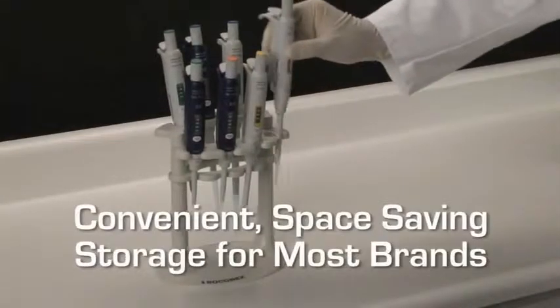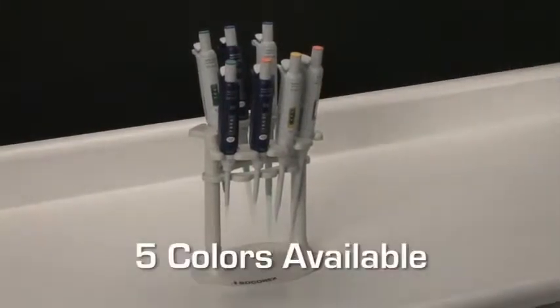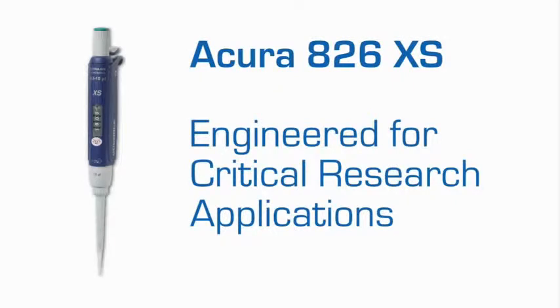A selection of stands for all models, including other brands, is offered to enable convenient, space-saving storage when not in use.